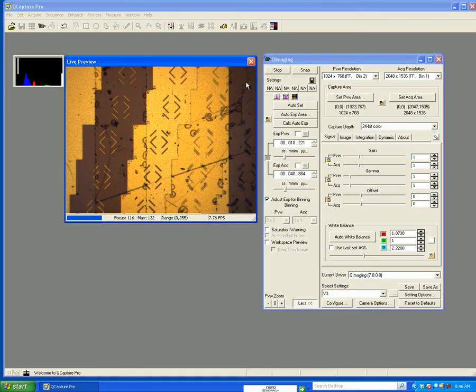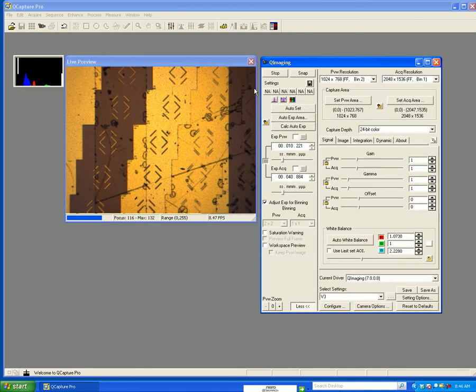Color is based on the voltage of the light source. All microscopes have a knob. This can be turned. You can change the color temperature of the light by adjusting the intensity. In this case, my microscope is set for a voltage level of 3. I want to adjust white balance.